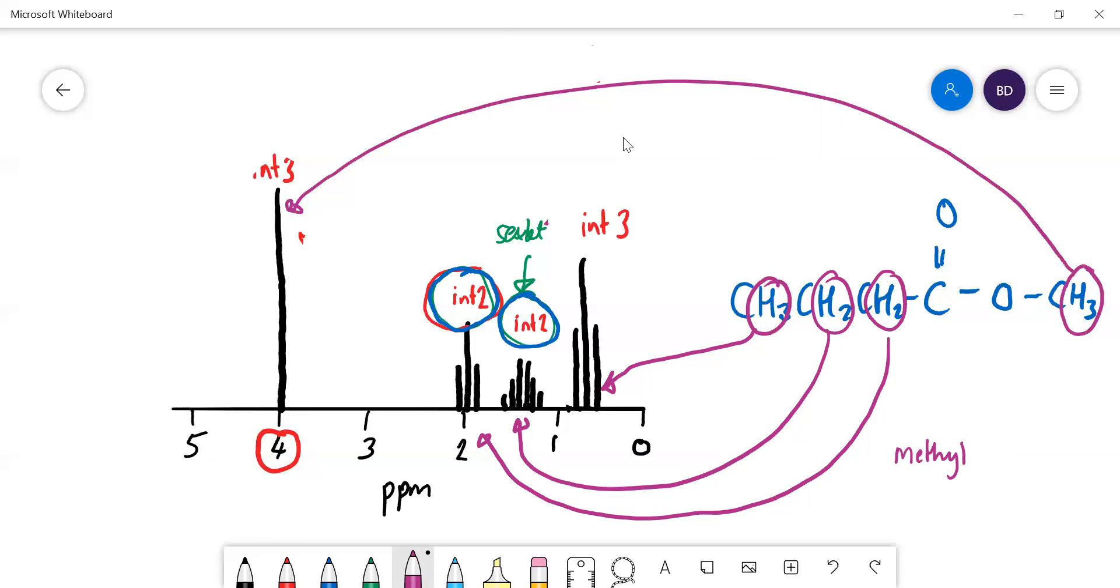And the name of that would be methyl butanoate. It's an ester. We haven't done much about esters yet. We did a little bit in GCSE, but we'll be doing them soon. So that is what we've got. Okay, thank you.